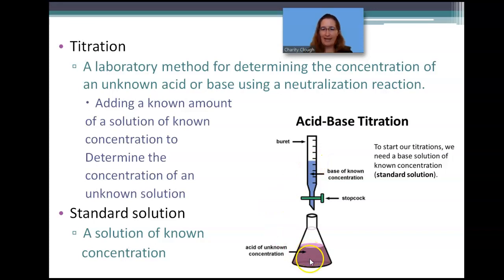What we do is we add an indicator to this acid, and as you drip base into it, at the point where it becomes neutralized, that indicator, usually phenolphthalein, is going to turn pink and show you that the solution is neutralized.